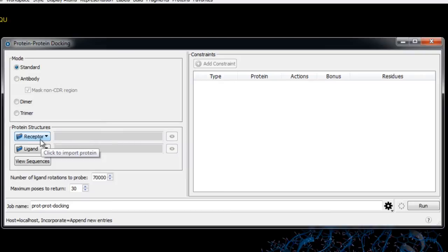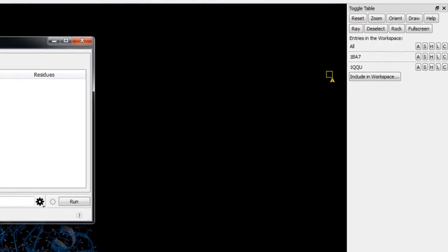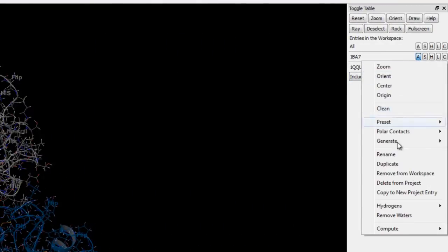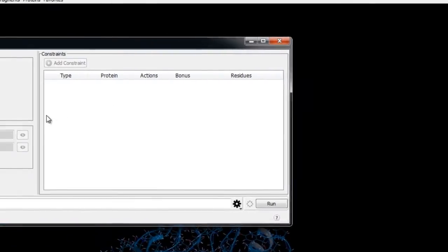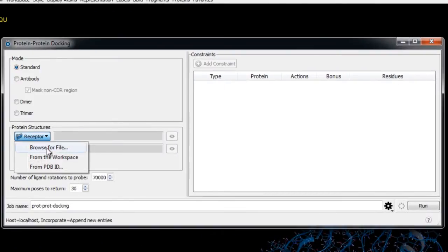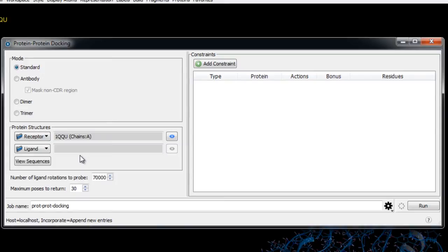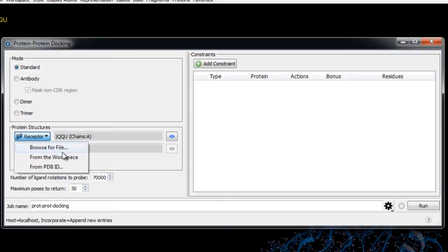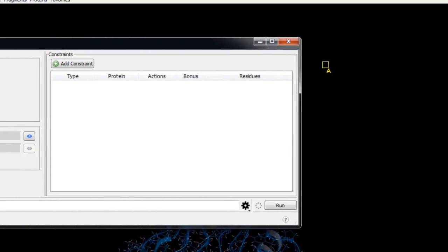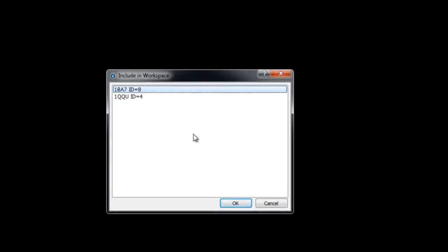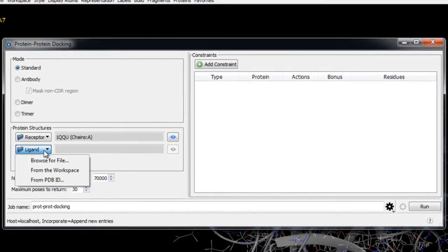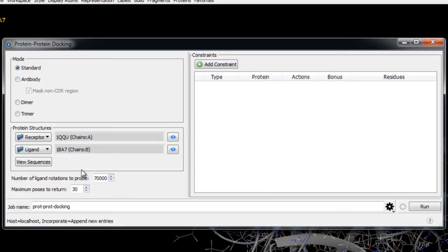Here we'll choose the receptor and ligand. First we'll make sure that 1QQU is included in the workspace by removing 1BA7 from the workspace, then for the receptor we'll choose from the workspace. You'll notice we could also have chosen a file or automatically retrieved the PDB, although in that case the protein will not have been fully prepared via the protein preparation wizard. Next we'll repeat the process for the ligand, making sure only 1BA7 is in the workspace.